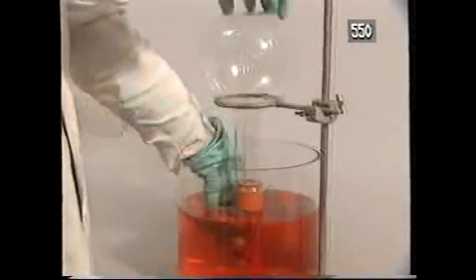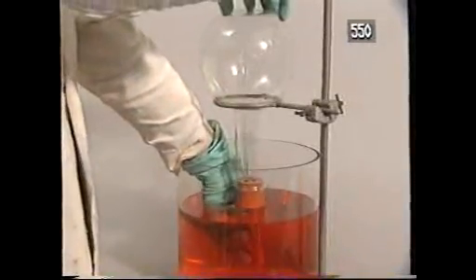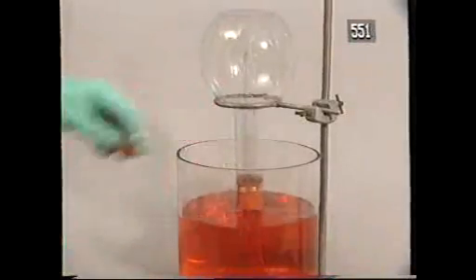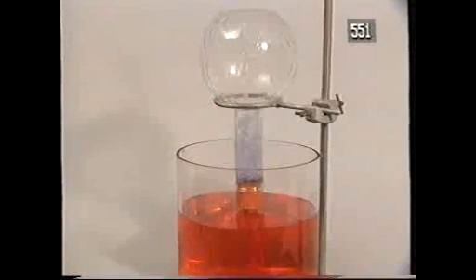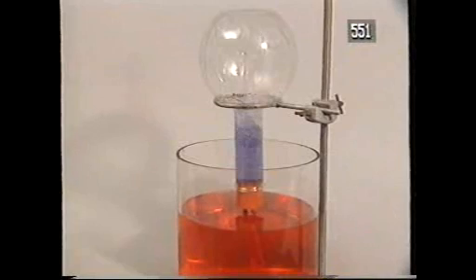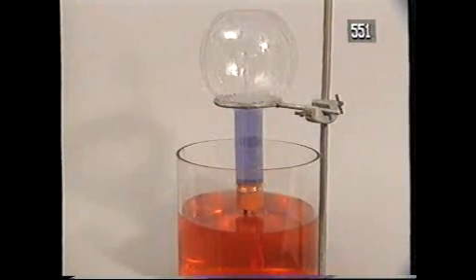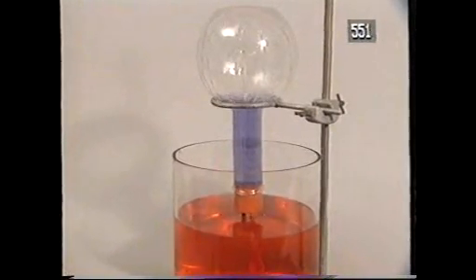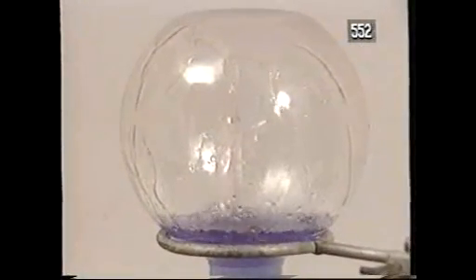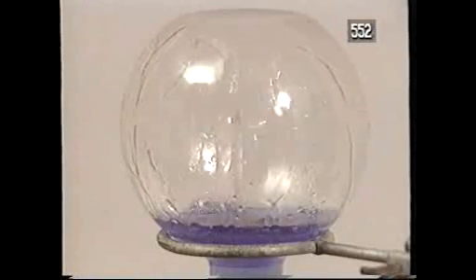The liquid slowly rises up the long tube. I'll give it a bit of encouragement. There it goes. The first few drops of liquid that enter the flask dissolve all the ammonia. That creates a vacuum, so the litmus solution fountains in to fill it. When the litmus gets into the flask, it turns blue, because a solution of ammonia is alkaline.